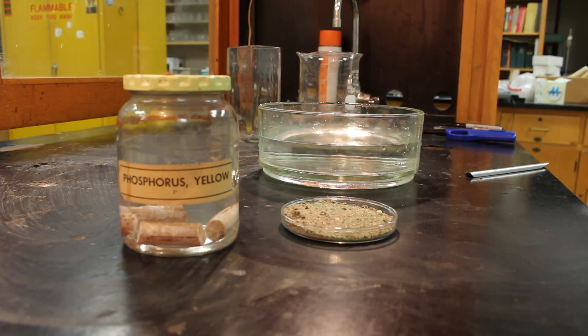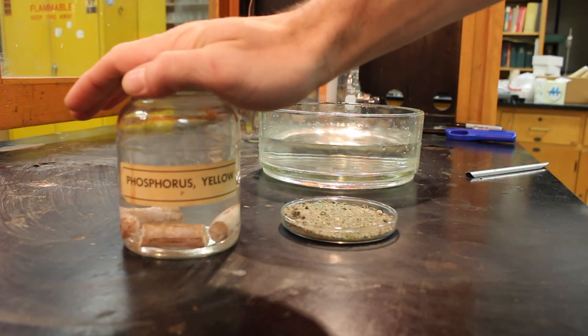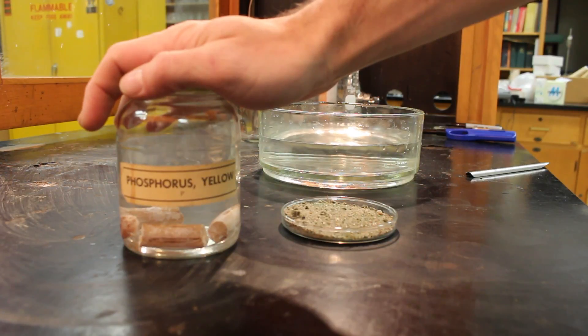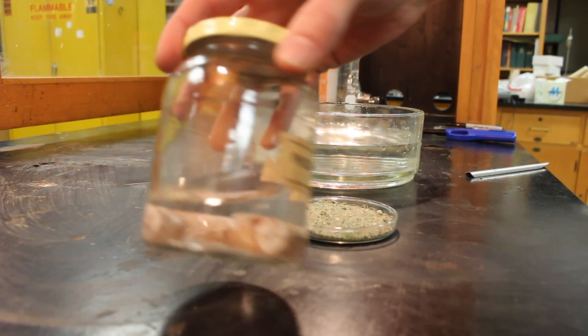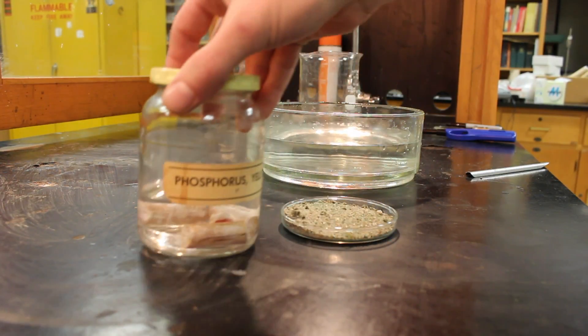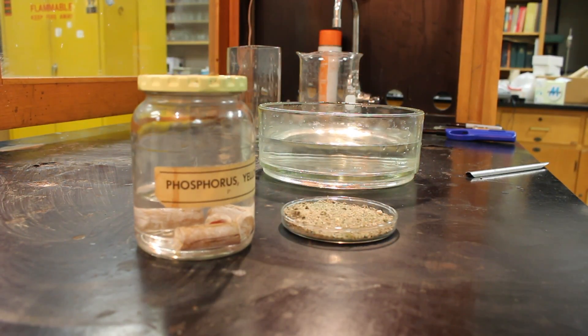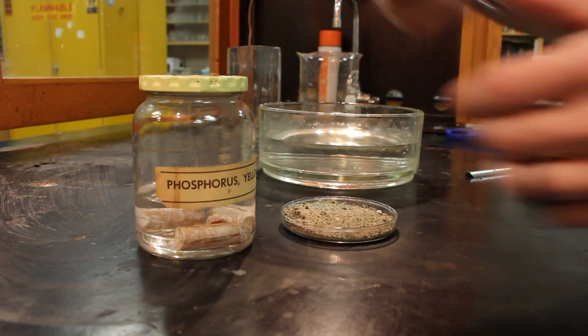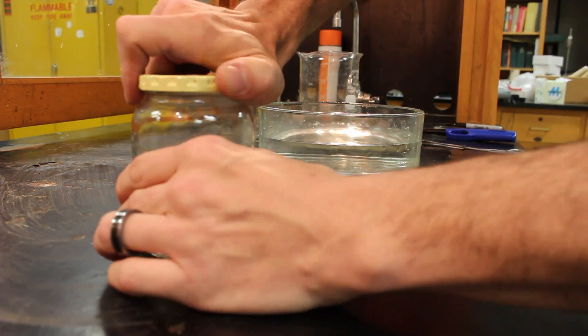Alright, so here we are in the fume hood and we're going to prepare some phosphorus so we can start a fire. The interesting thing about phosphorus is it has to be kept under water — it's so reactive with oxygen that we store it in water. Inside here we've got some pieces of phosphorus submerged, and in order to cut it we have to pull it out and cut it under water as well. I'm just gonna grab some tongs.